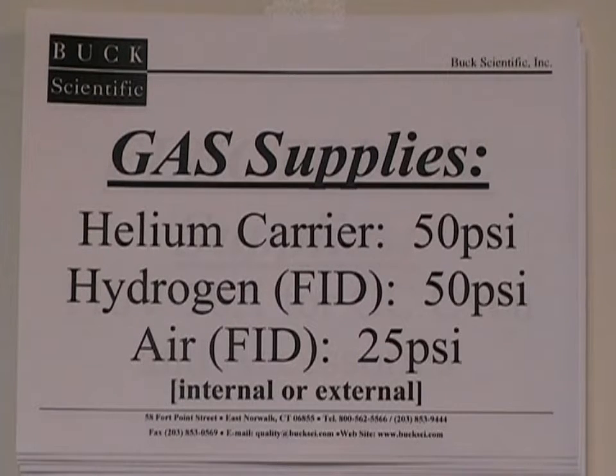This particular GC configuration utilizes an internal air compressor for the FID support gas, but you will still need an external supply of helium for the carrier and the purge, and hydrogen for the other FID support gas. These are the recommended delivery pressures from the regulator on the gas tank to ensure a consistent flow of gases into the GC, which will affect the consistency of your chromatography. Make sure these are set before beginning any analyses.